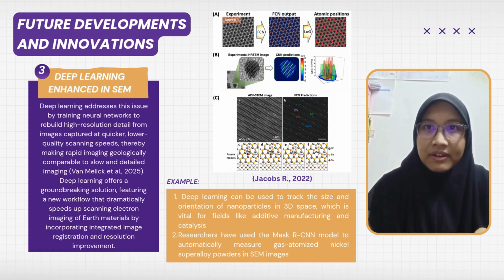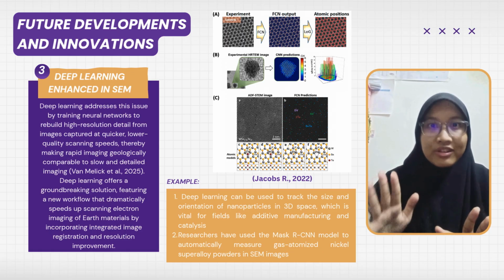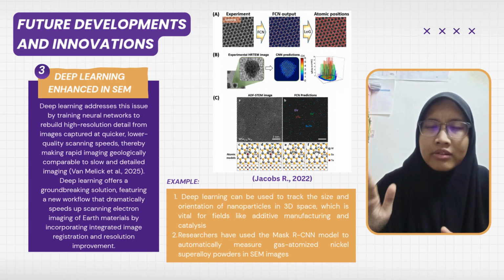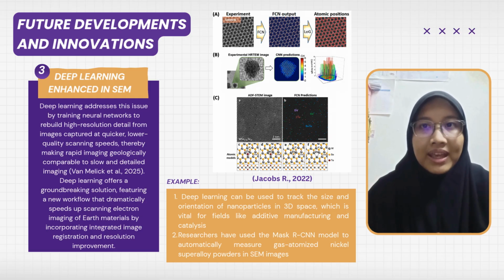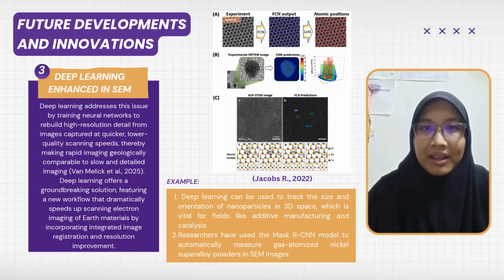Hence, deep learning offers a groundbreaking solution featuring a new workflow that dramatically speeds up scanning electron imaging of Earth materials by incorporating integrated image registration and resolution improvement.